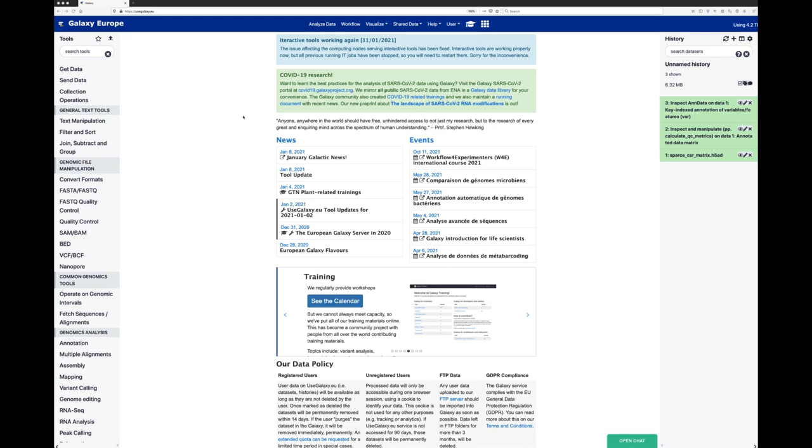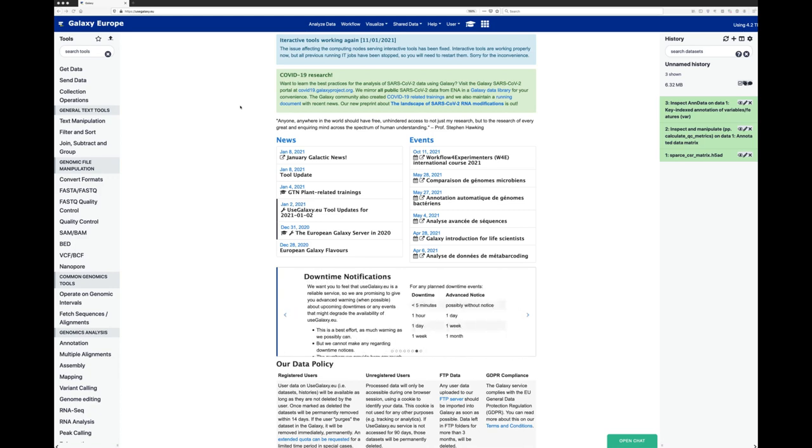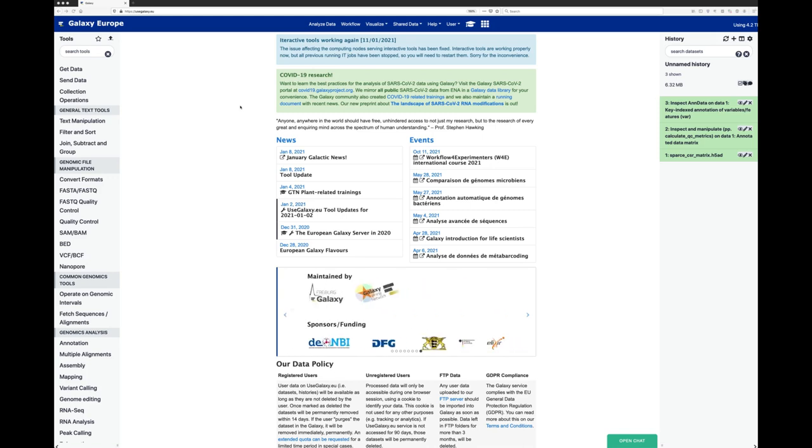Before, you listened to the transcriptomic lecture from Fotis, and now we will apply what you learned during these lectures to RNA-seq data, real data. For that, we will use the European Galaxy server that you can reach at usegalaxy.eu. You should have learned how to log in when following one of the Galaxy introduction tutorials, so please log into this server and then we will follow the tutorials.